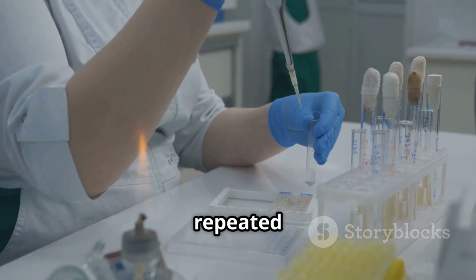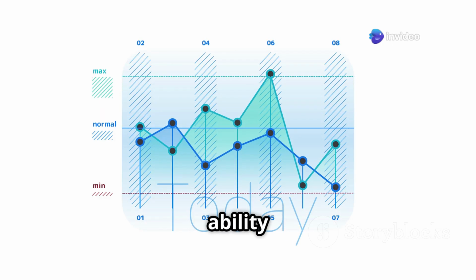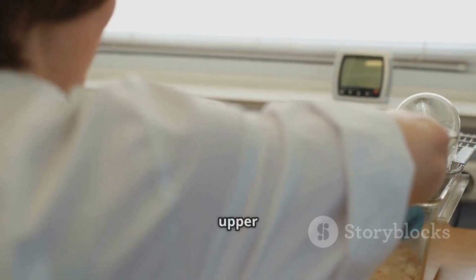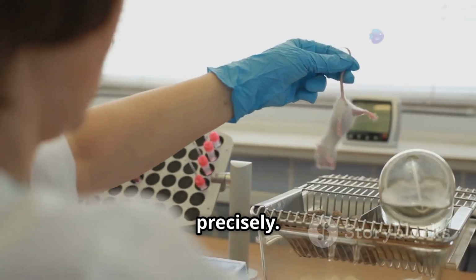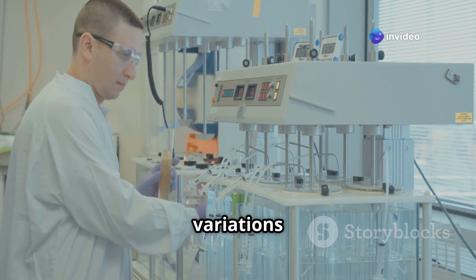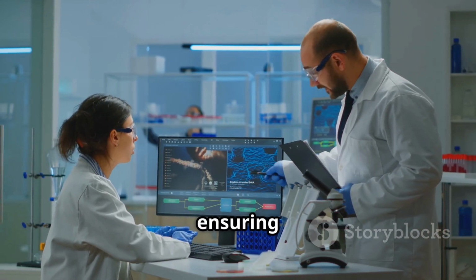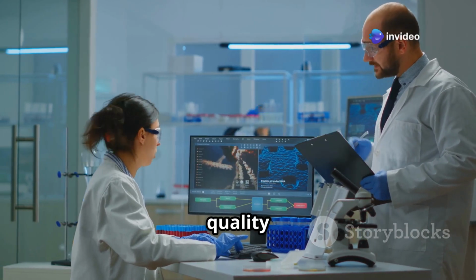Precision measures how close repeated measurements are to each other. Linearity assesses the method's ability to produce results proportional to the drug concentration over a specified range. Range defines the upper and lower limits of drug concentration where the method performs accurately and precisely. Robustness evaluates the method's susceptibility to minor variations in experimental conditions. A validated IVRT method provides confidence in the results obtained, ensuring they are reliable and can be used to make informed decisions about drug development and quality control.